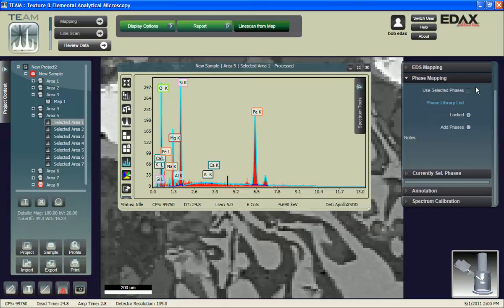And so in order to use this feature, you have to select this. And there's a little note down below that says use selected phases from project tree. And also it's a reminder about a feature that we're not currently using right now about multi-field detectors. Actually, multi-field analysis we do use, and dual detectors, which is something we'll be doing shortly.